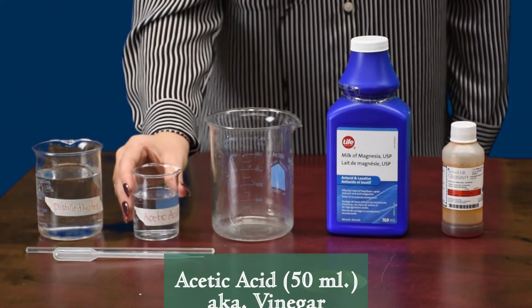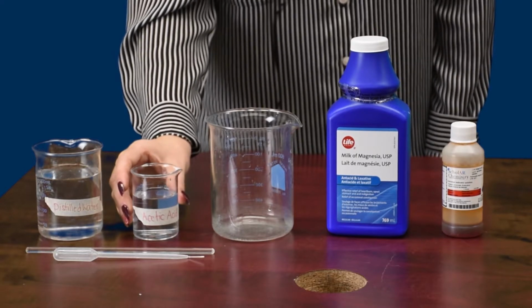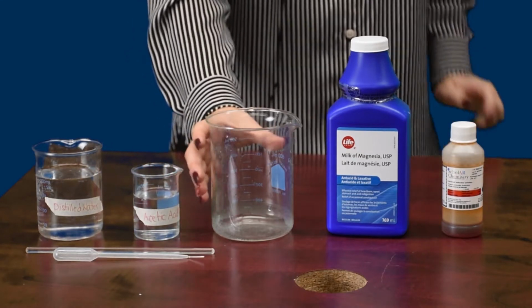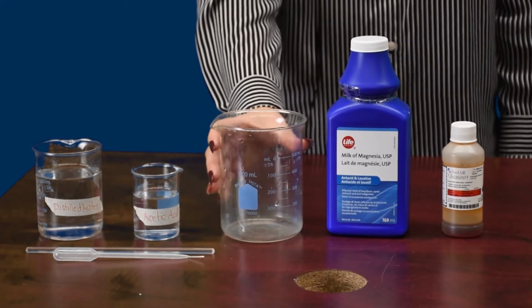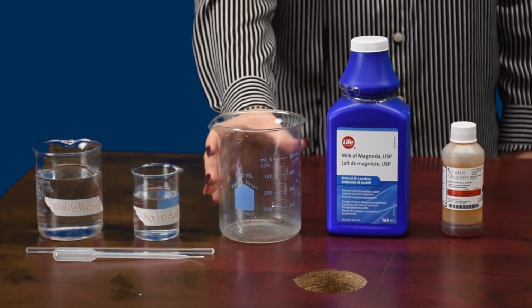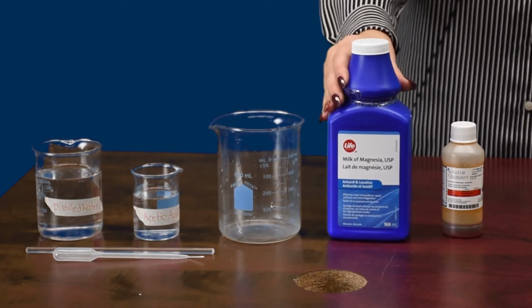The next thing you need is acetic acid, otherwise known as vinegar. You just need a small amount, maybe 50 milliliters or so will be sufficient for this experiment. You will need a 500 milliliter beaker or larger to conduct your experiment. If you don't have access to a beaker, any sort of large glass that is at least 500 milliliters will work for this experiment.